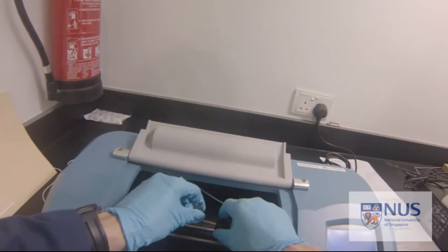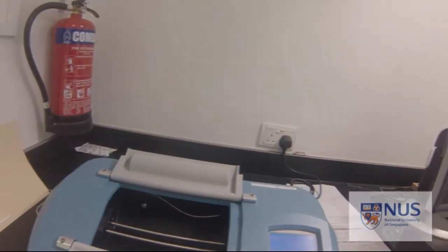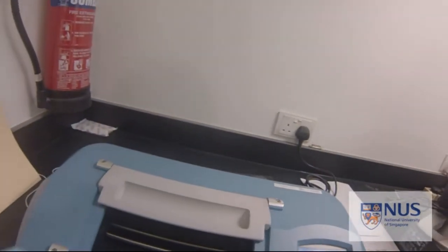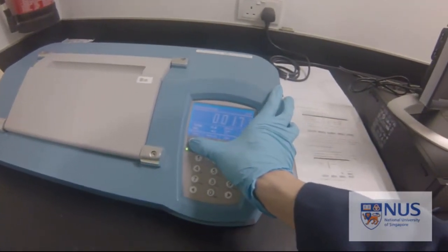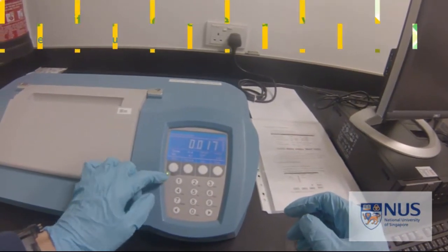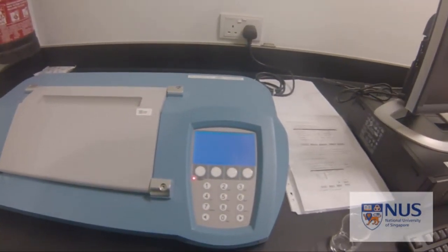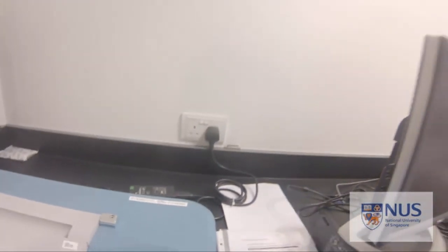After this is done, remove the cell and discard the solution. Remember to close the lid — it should not be left open. Press the button to go back to manual. Press and hold, then switch it off. Turn off the plug. Thank you very much.